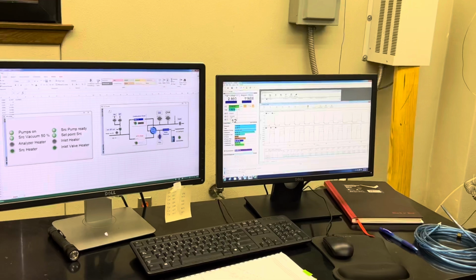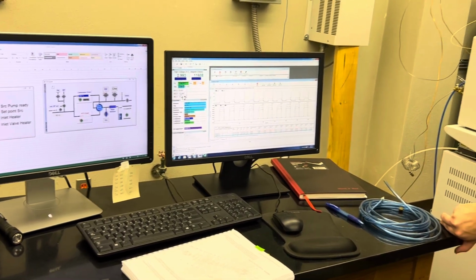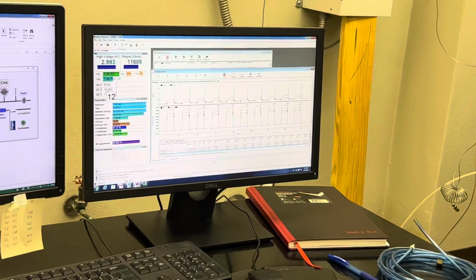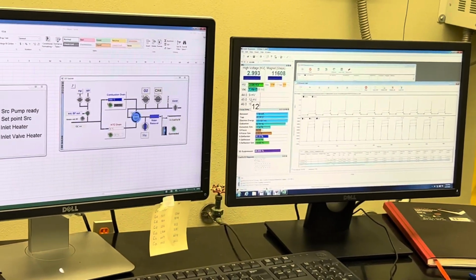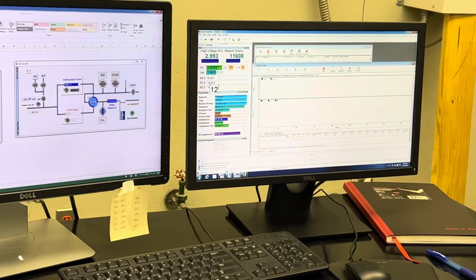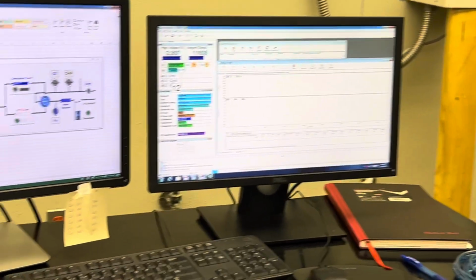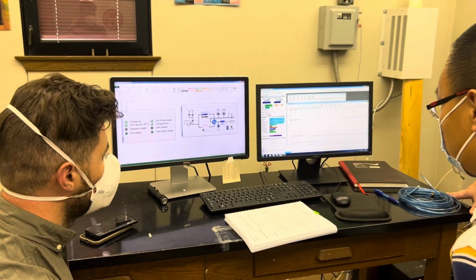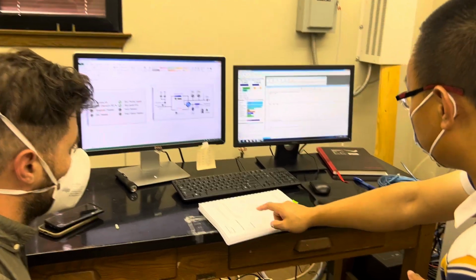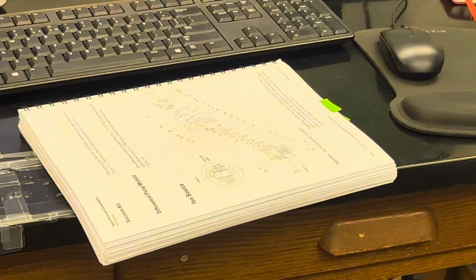So 40 and 28 are both checking air, right? So you're checking argon and you're checking nitrogen. Argon, because it's such a small percent of air, will easily show you when there's a major leak. But checking it on a different cup for nitrogen will also give you kind of the same information. There's a table here telling what reading is good. Yeah, it's somewhere in there.